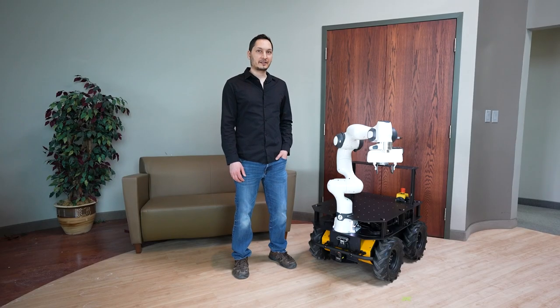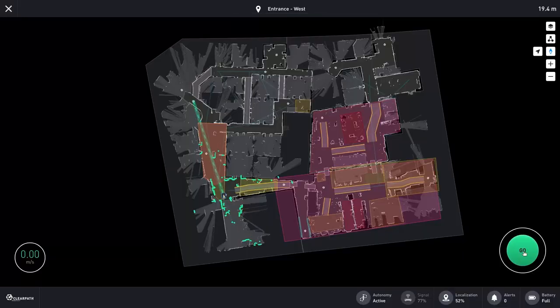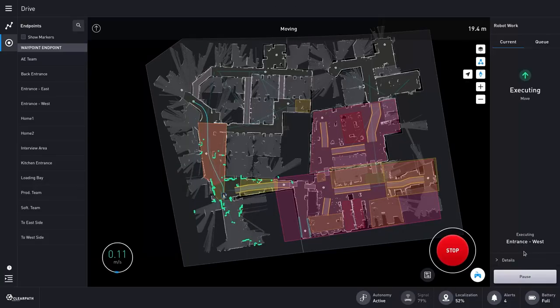Finally, we've added ClearPath Robotics indoor navigation, mapping, and object avoidance software.